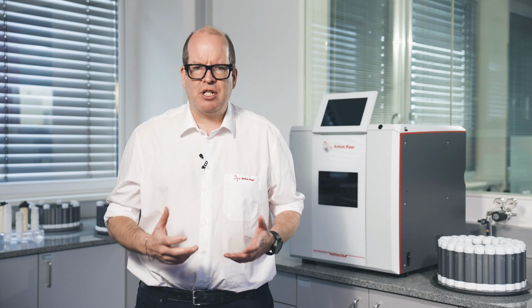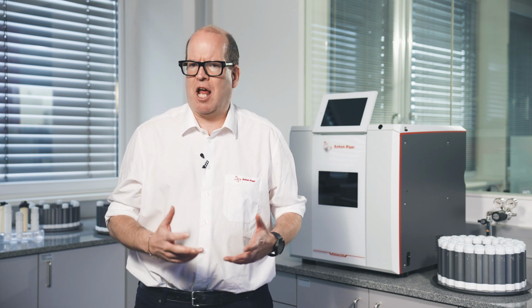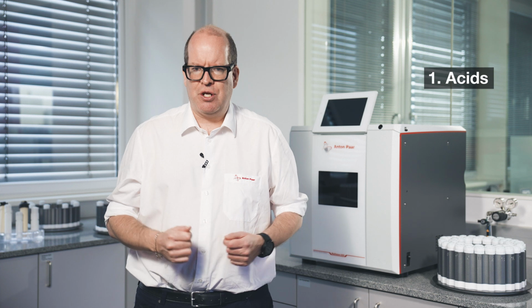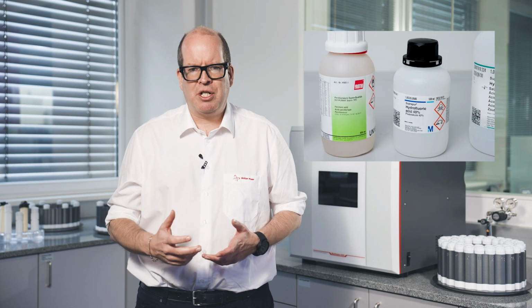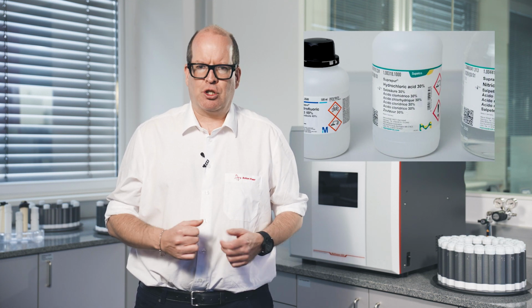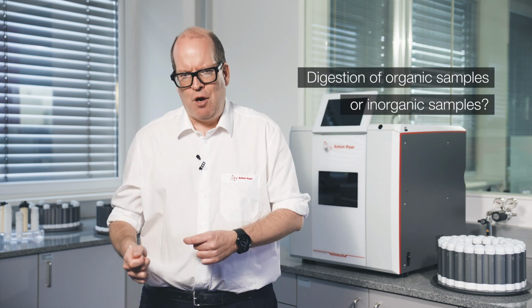Now, how can you successfully perform a digestion? What do you have to observe in the digestion process for successful AAS analysis? First off, which acids do you need? Only a few acids are important for digestions. Which acid to use is defined by the sample. The most important question is, do you have an organic sample or an inorganic sample?